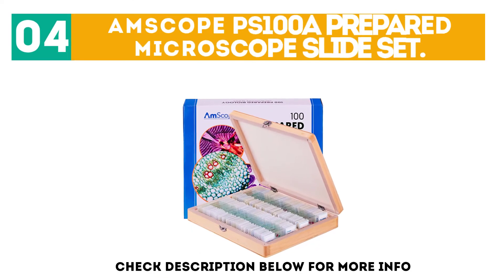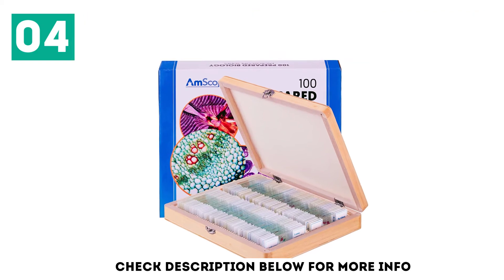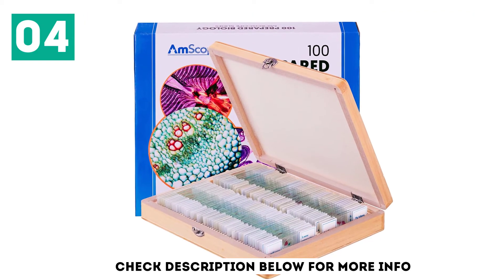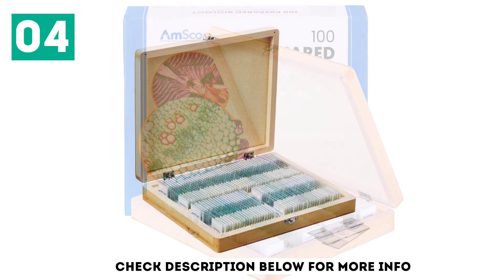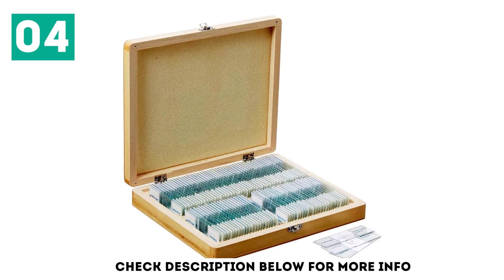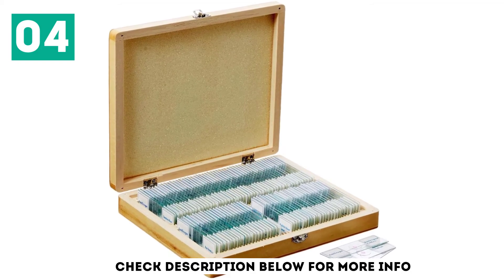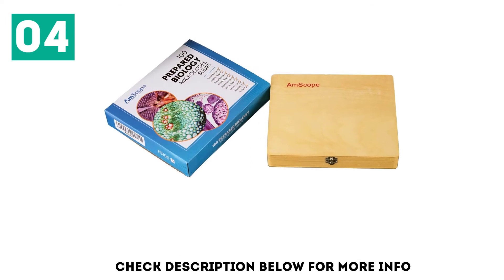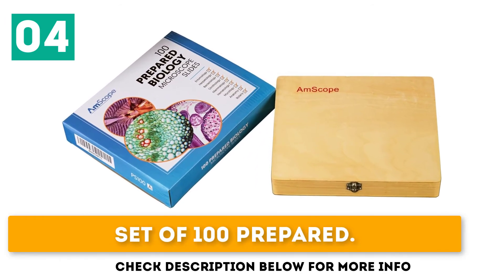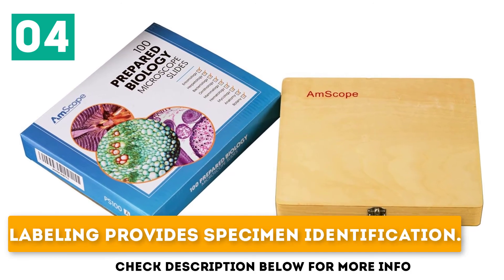At number 4: M-Scope PS100A Prepared Microscope Slide Set, including plants, insects, and animal tissues, for use in biological education. It comes with a protective wooden box to prevent breakage, suitable for basic biological science education, and makes a perfect gift. Key features: set of 100 prepared slides, protective wooden box, and labeling that provides specimen identification.